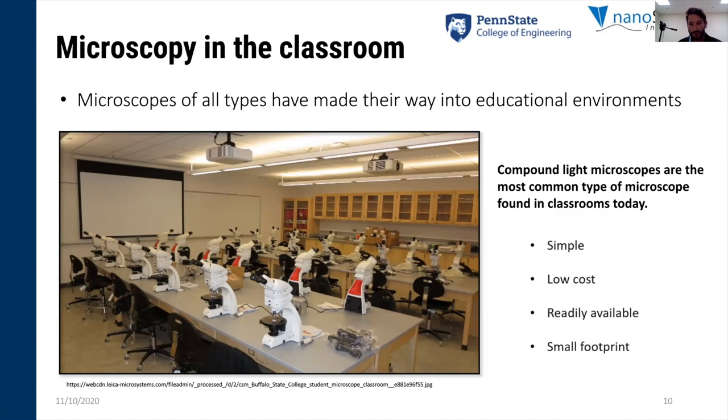Now, a lot of these reasons that compound light microscopes are so common, if you were to use a microscope remotely, you wouldn't necessarily have to worry about some of these things, right? Like small footprint, no longer a big deal if you're using the instrument remotely. The microscope could take up an entire room. Who cares if you're using it from home?